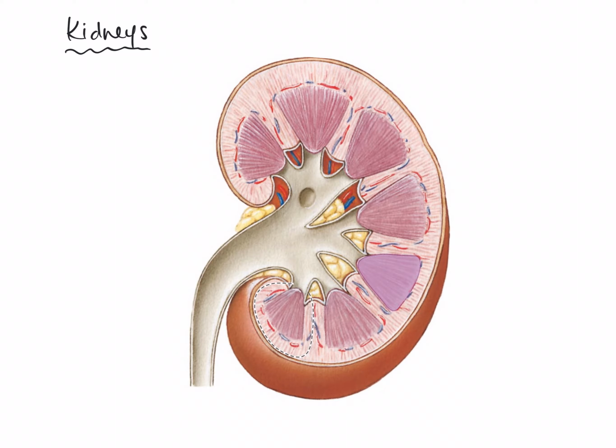So with looking at this cross-section of a kidney, what are the three main segments that you'd separate this into? I think it would start with the renal cortex, and that would be the outermost or the cortical layer, as most of you would be familiar with other terms that begin with cortex. Anything that means cortices just means on the outermost.